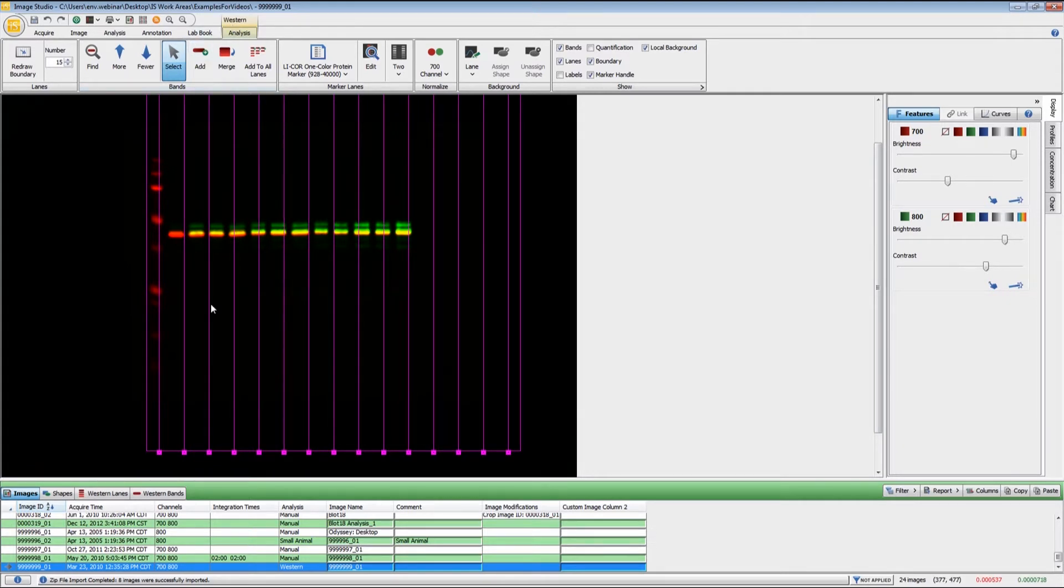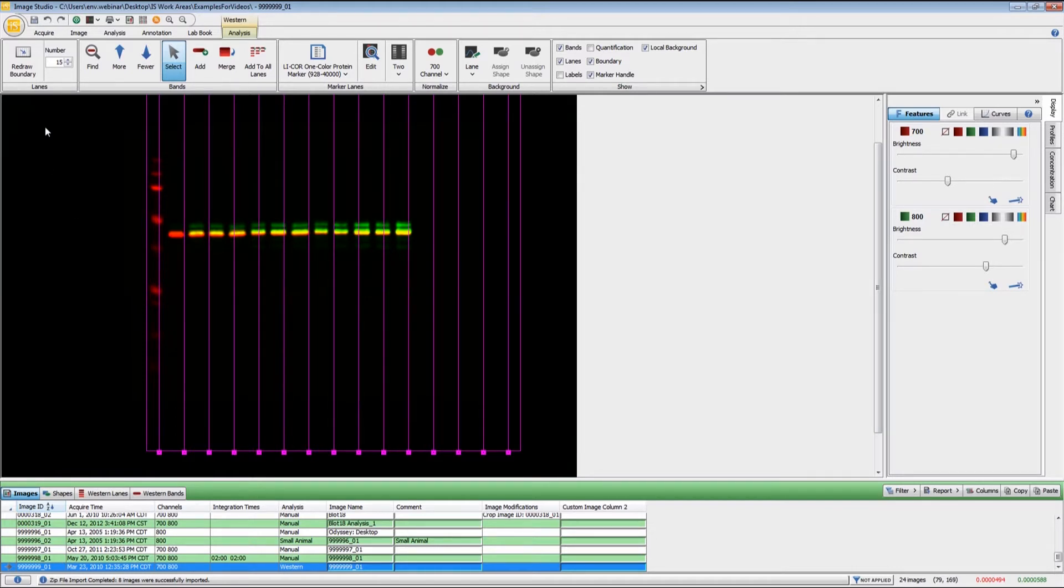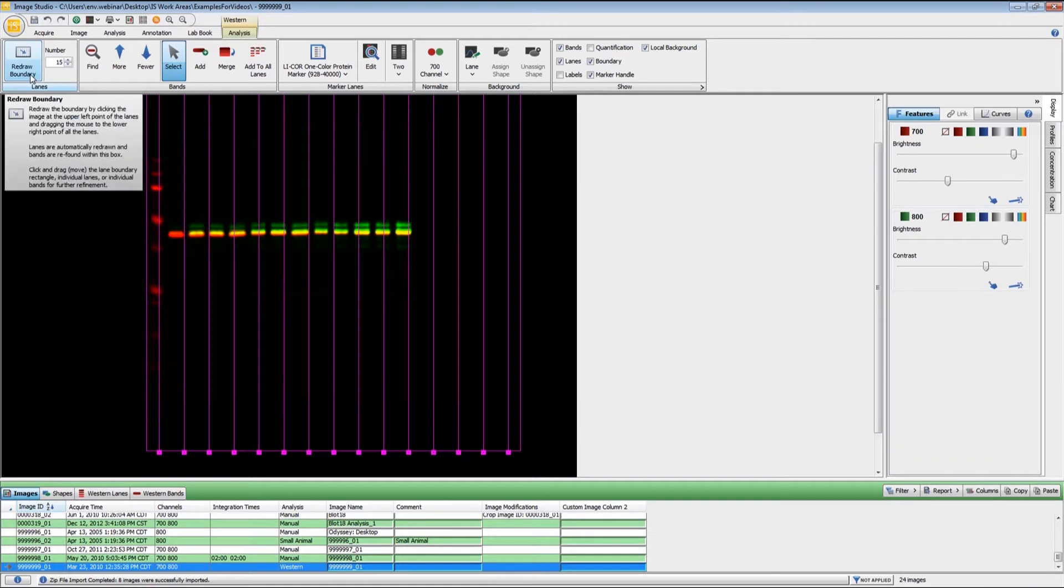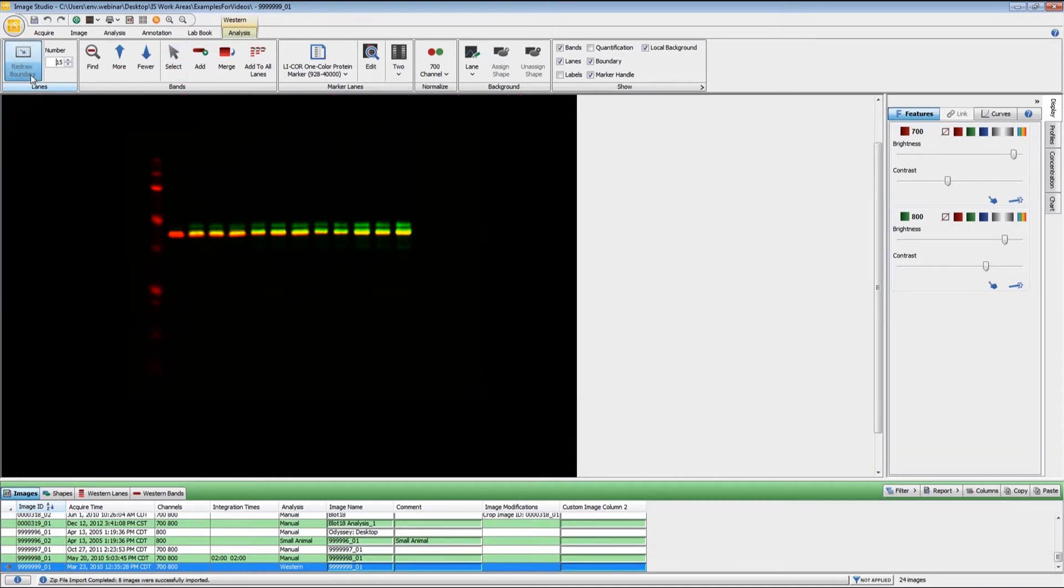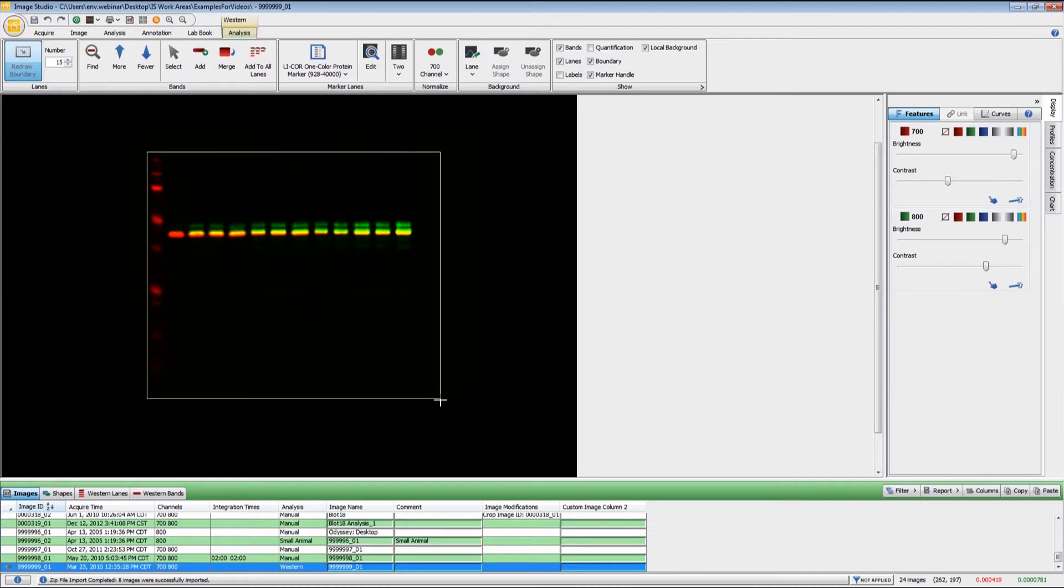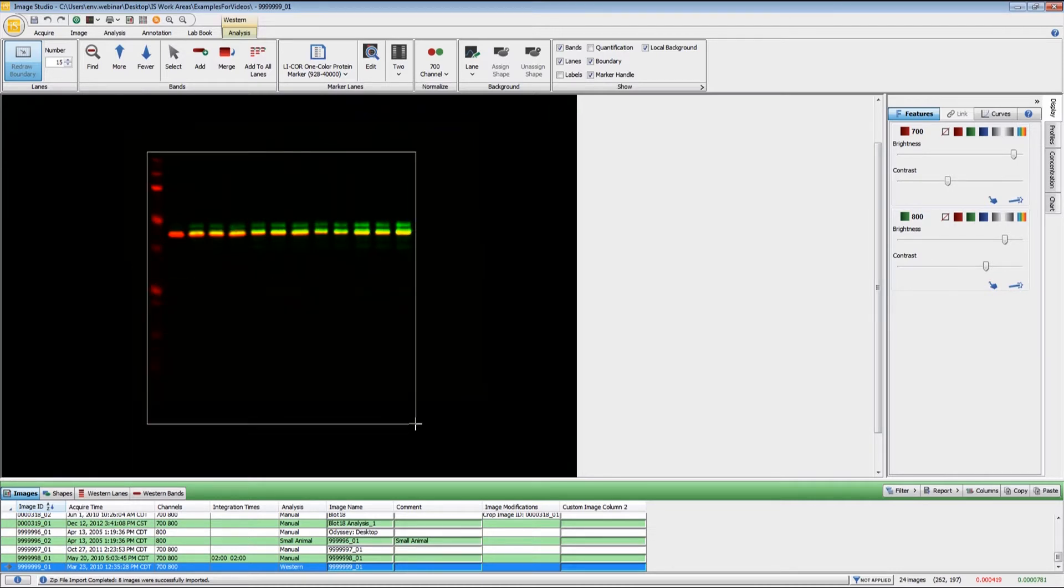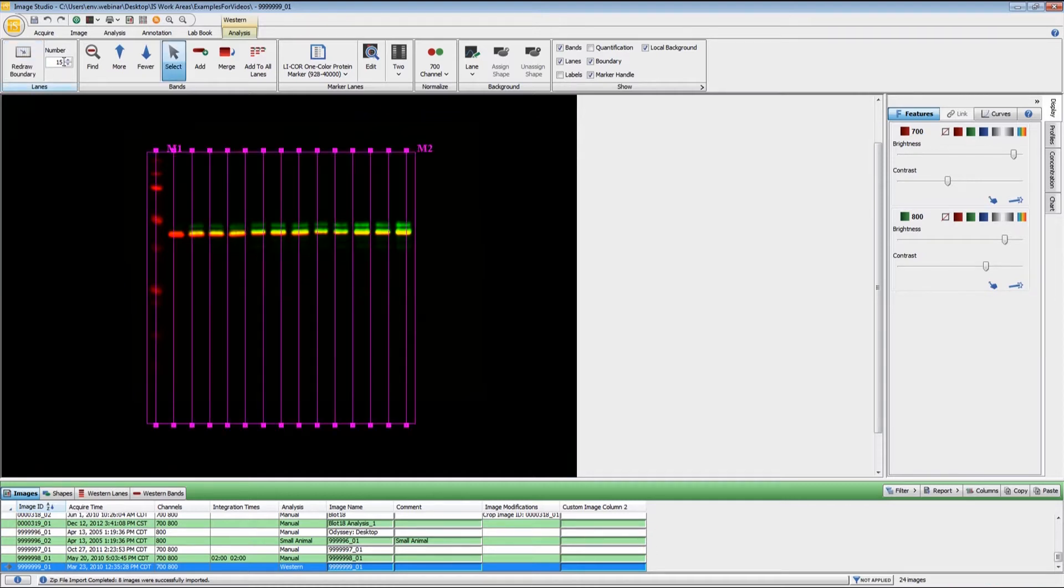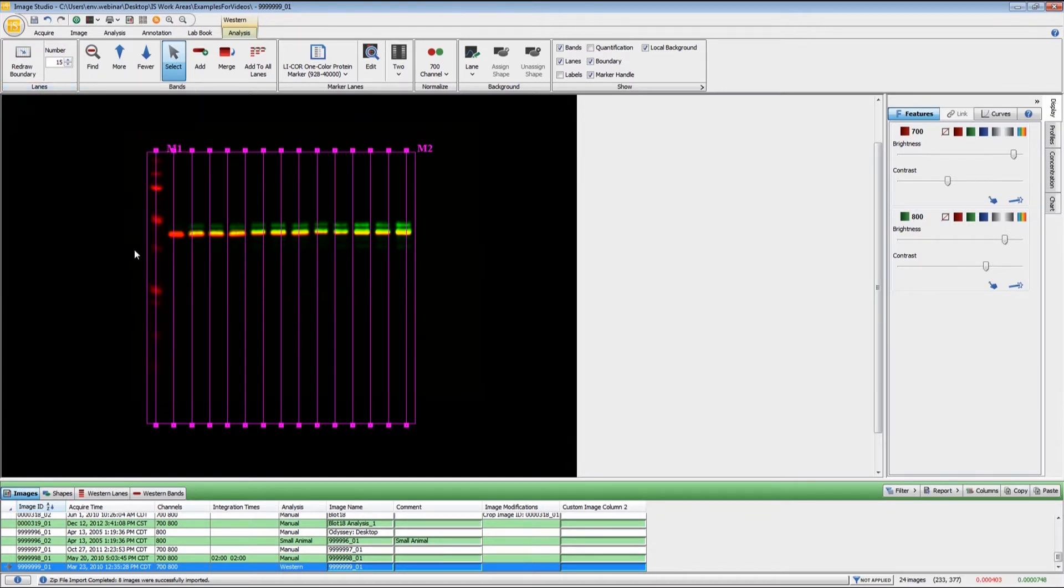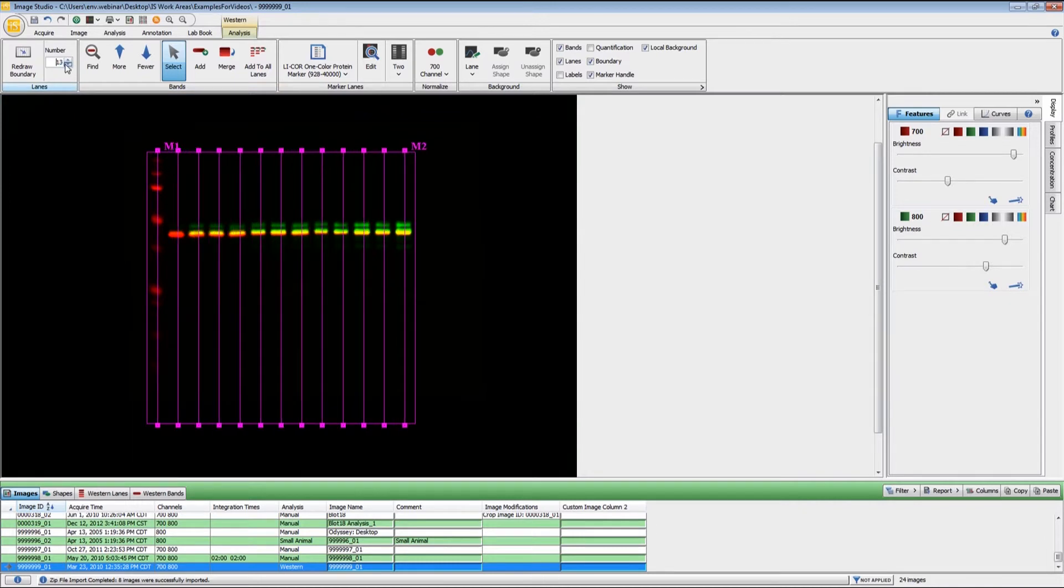Chances are the markers or the boundary will not be in the correct location. The easiest way to do this is to click on Redraw Boundary. When you do that, you click and drag an area around your outer lanes. Once the lane lines appear, you will need to adjust the number of lanes that you have on your image. For this particular Western blot, there are 13 lanes, so I'm going to adjust this to 13.